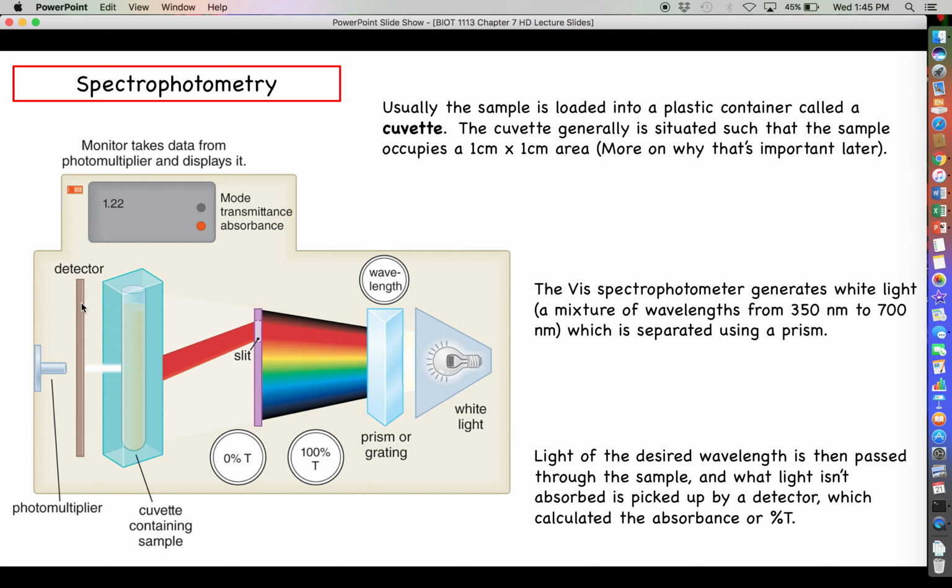So that dye, Coomassie Brilliant Blue, turns a vibrant blue color when it is bound to protein. But what is it that actually makes it appear blue to us? Well, the answer to this is that when we see color, it is because the light that shines on what we're looking at absorbs certain wavelengths and reflects others.